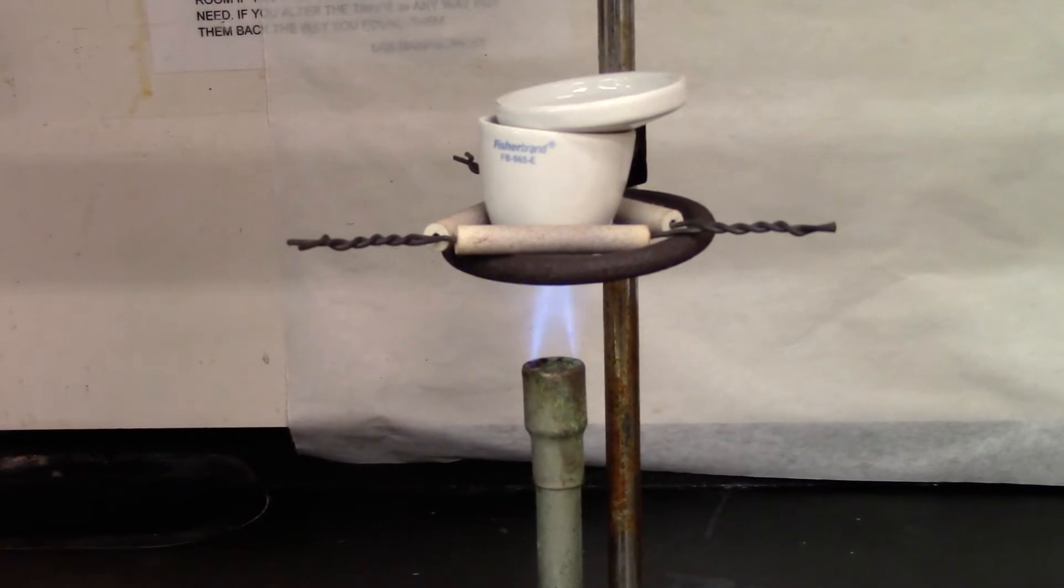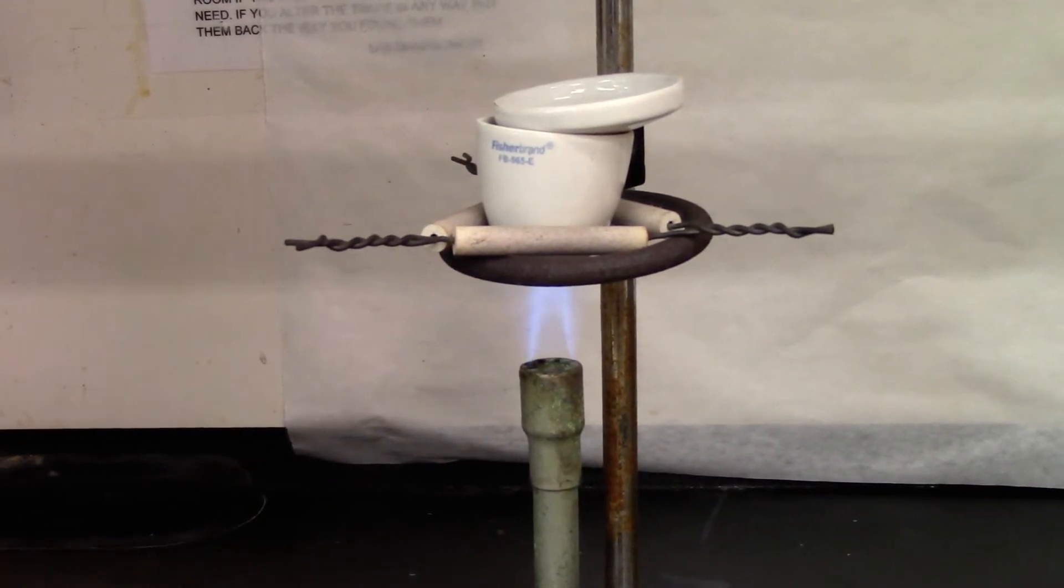So if you see the tip of the inner cone should be close to the bottom of the crucible so the heating is strong. So now I'm going to let it heat for about 10 minutes.